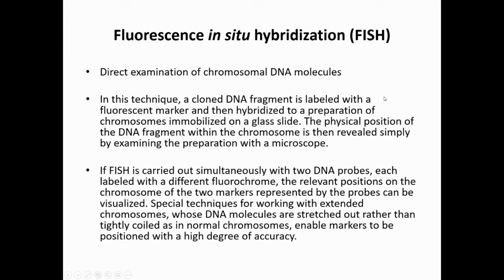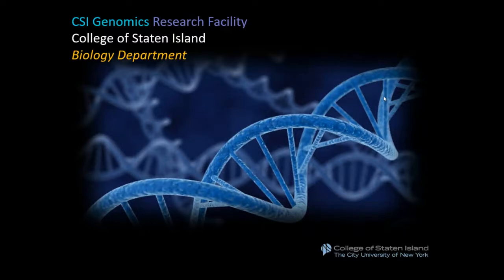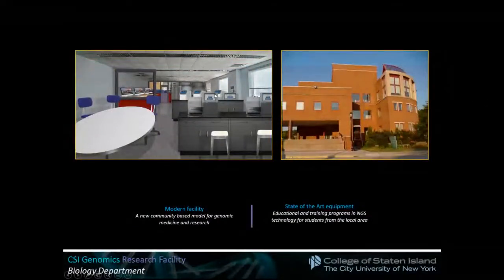And perhaps you have heard that the CSI received funding to set up this genomic research facility. We received like $1.25 million, so we're going to acquire the equipment to set up the genomic research facility. We will acquire the NGS sequencers, and this is the design in 6S. Do you know 6S138, the lecture room?